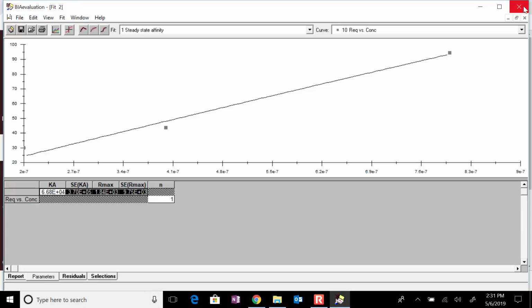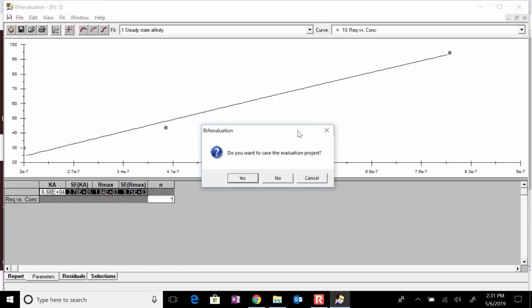And you should see it go up in a sort of hyperbolic pattern. In other words, as you double the concentration, you should see it go up, but go up less than double each time. So you should see it getting closer. And it looks like our middle point, like that 400 point right there, does not follow that pattern. In fact, it looks like it's going up more when we go to the higher concentration than it should. So that's just a sign that's something that we can change.